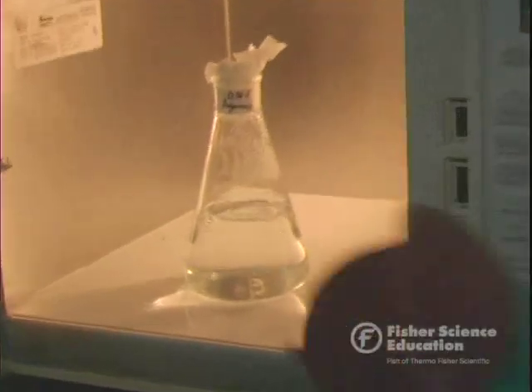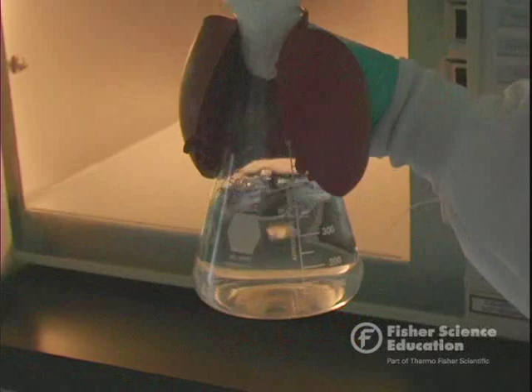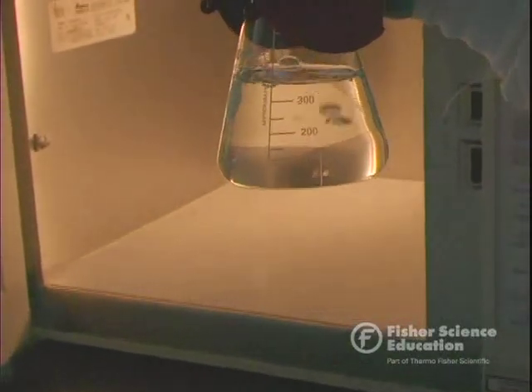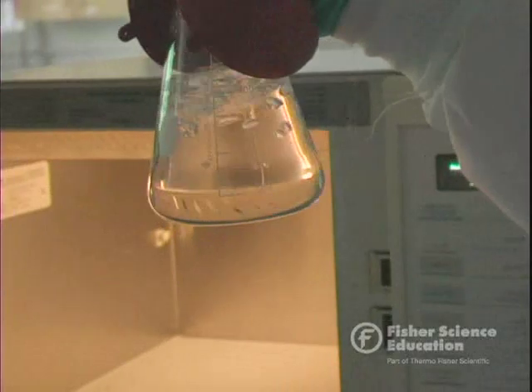Remove the tissue, give it one last swirl, and check it again — watching for superheating. When it's finished, it'll be clear like water with no floaties, and that's what we've got here.